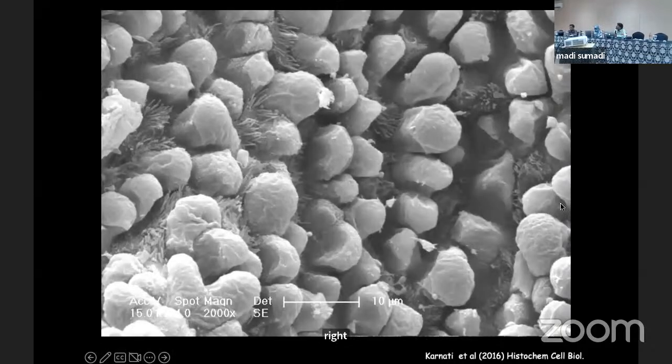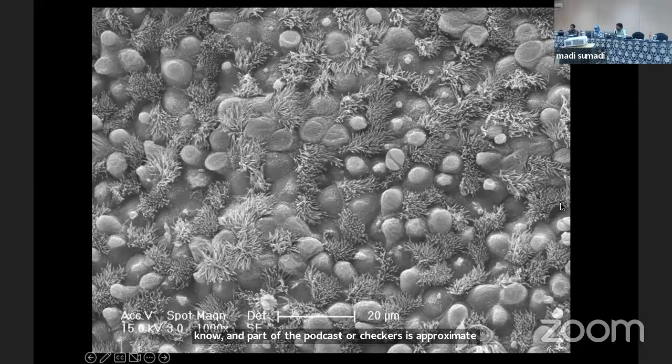These are the terminal bronchioles, the end part of the whole conducting airway. This is a proximal part. And you see there are fewer club cells, but more cilia. Makes sense, right? Because of the function. From outside, you get the air. Air, of course, contains a lot of oxidants and also traps all kinds of materials out there. And the upper, proximal part should be broader, so we should have more cilia, because of congestion or any kind of bacteria, the cilia can trap them. Yeah, and that's why we see this. This is nature, right? How they are generated to fit their function.